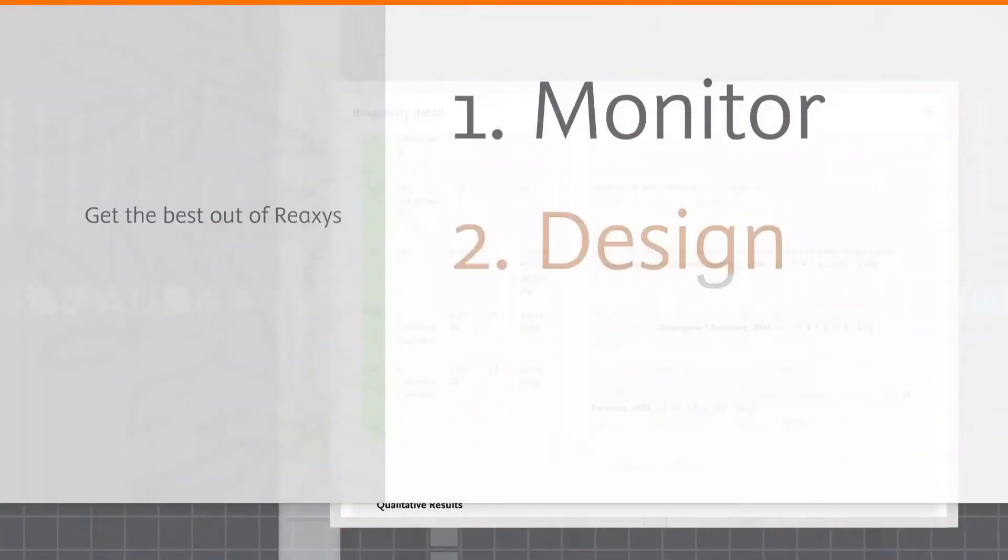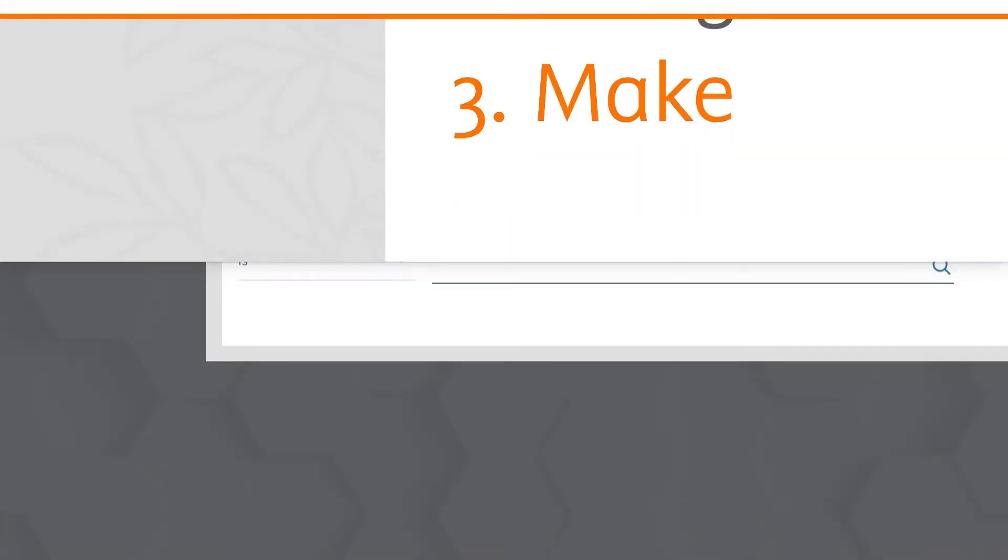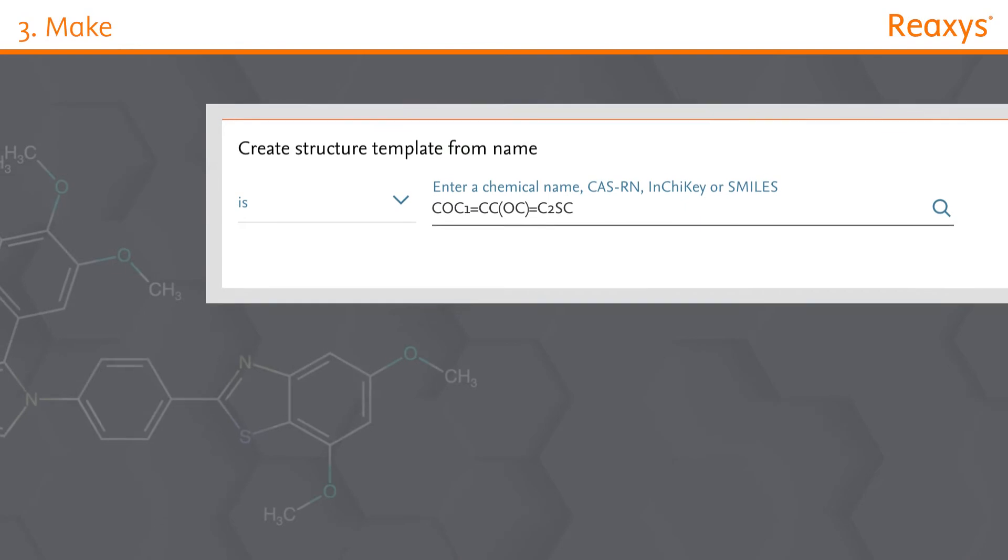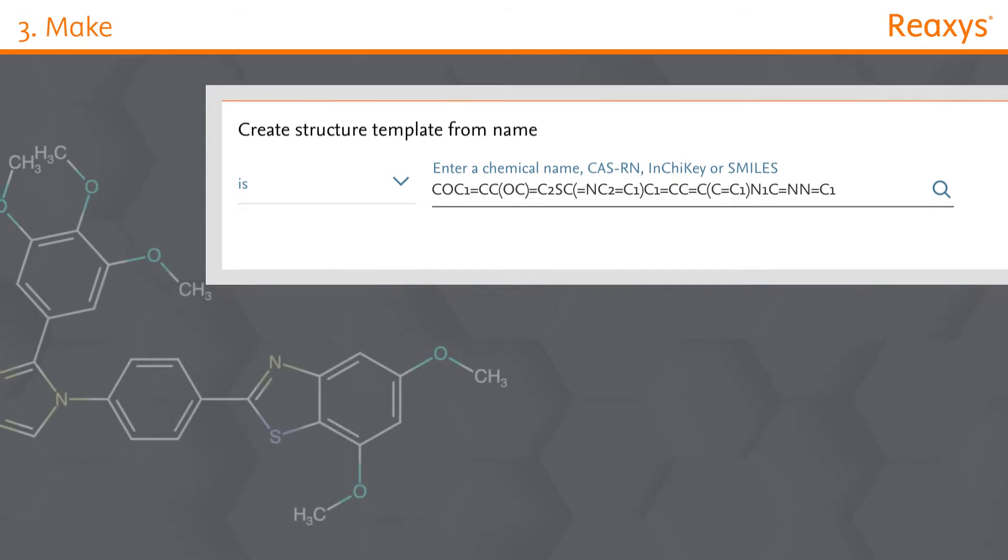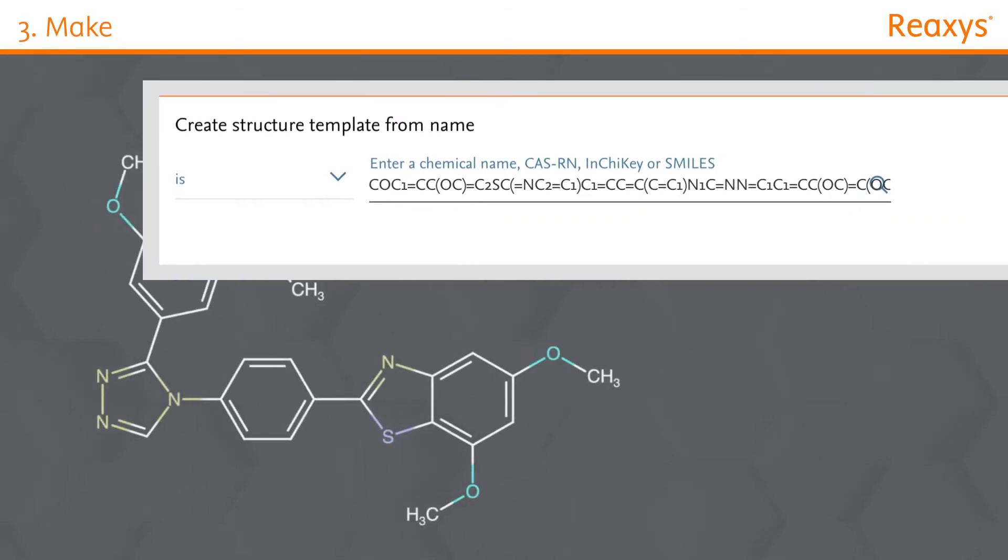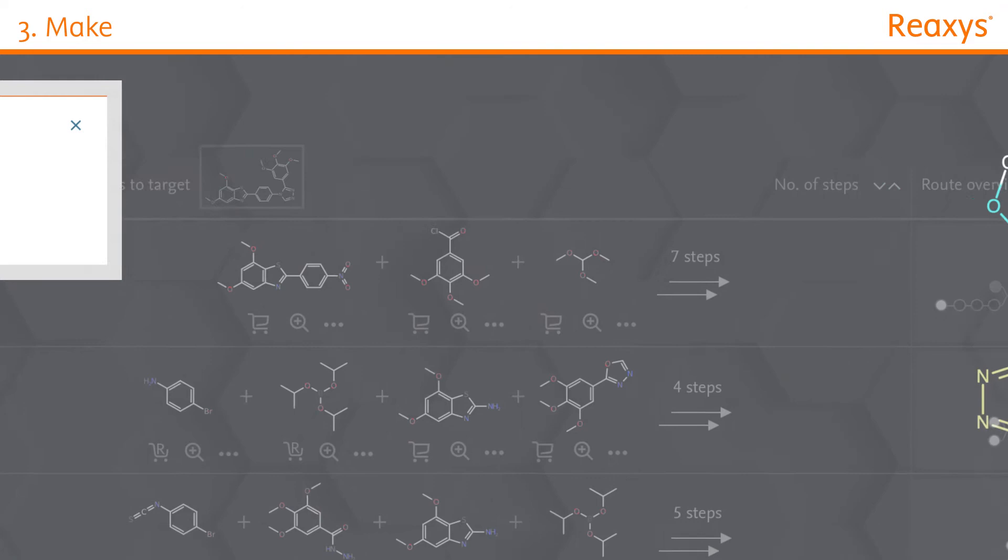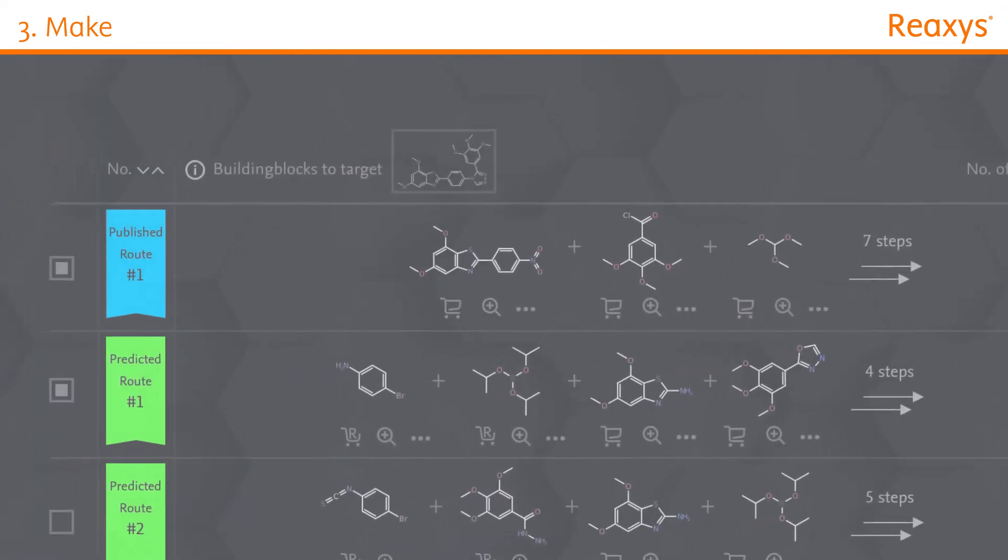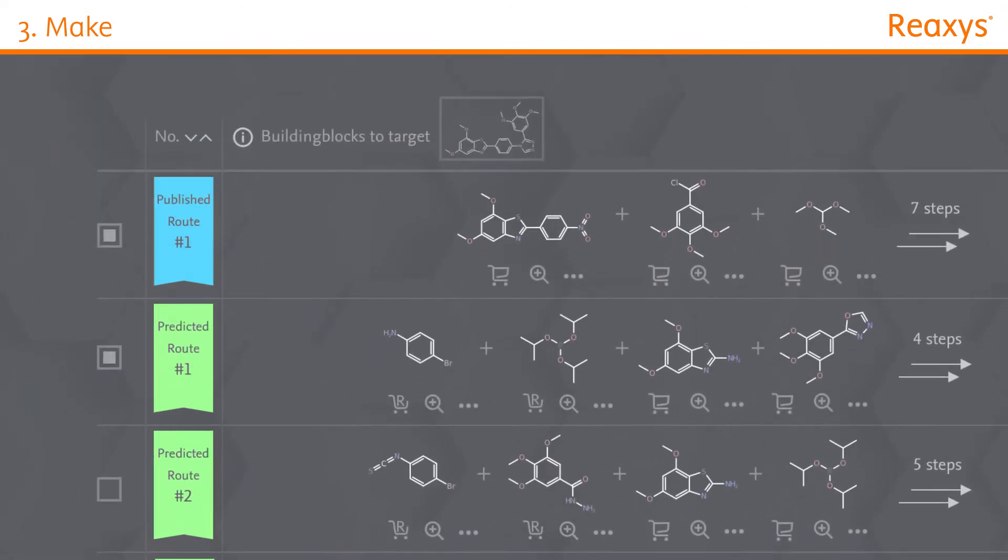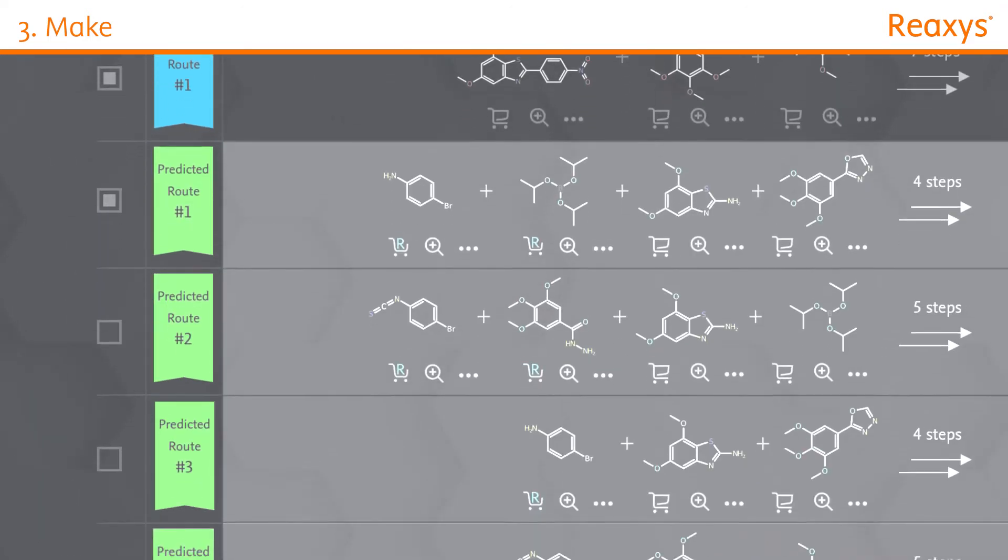Want to start working in the lab? Reaxis provides all the information you need. Search for a preparation or reaction of your compound of interest. Plan and organize synthesis routes with the Synthesis Planner, integrating published and predicted routes.